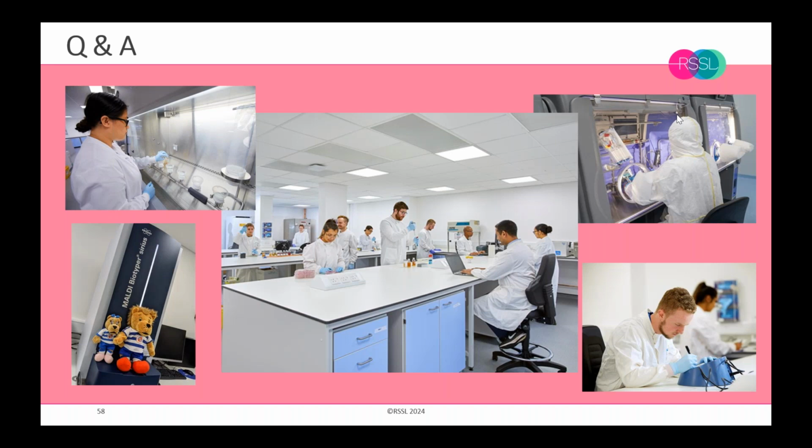Okay, and I think this will be our last question, from Vishwas. Is it okay to expose settle plates continuously instead of active air monitoring during aseptic filling operations?